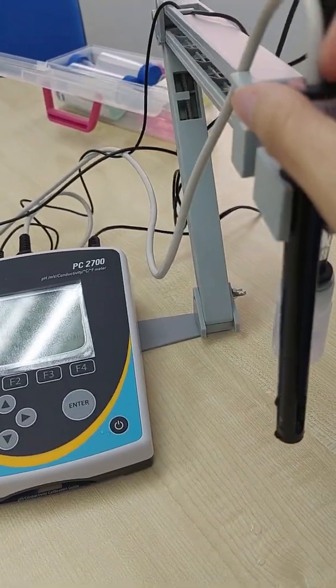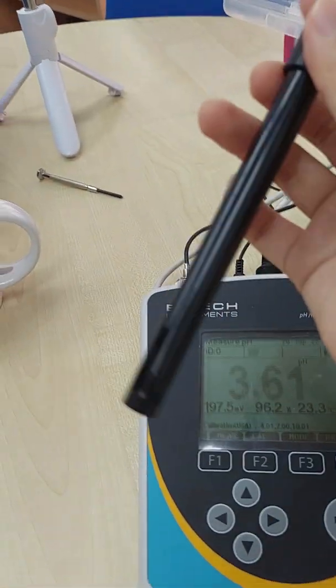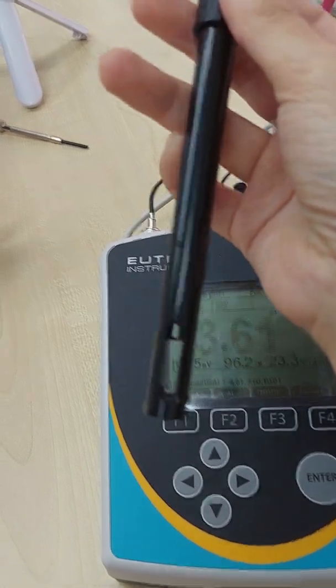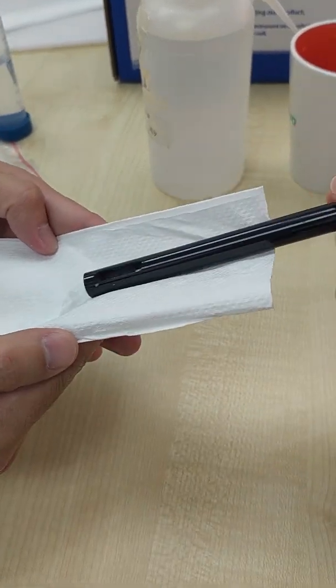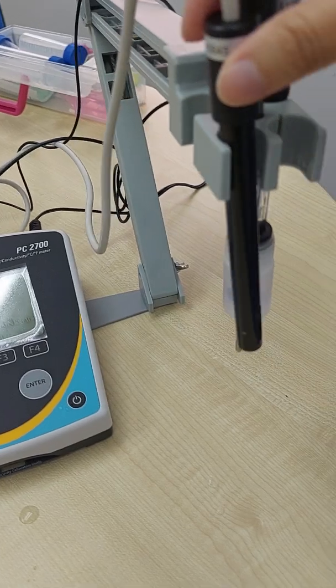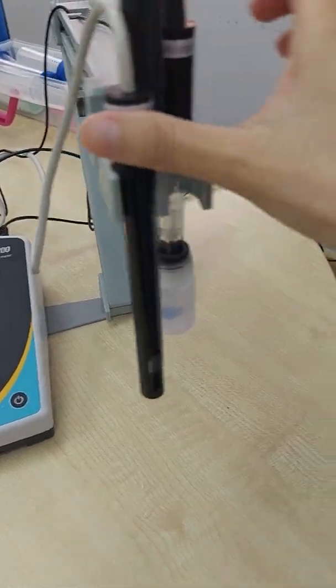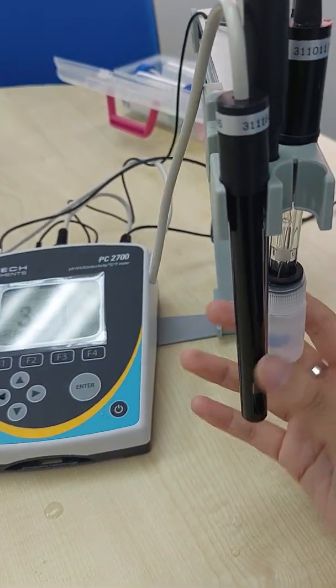And then for conductivity, there is not much maintenance. You just store it dry. So for conductivity, you can rub it, it doesn't matter. Just for pH, do not rub it. So these are the maintenance for these two probes.